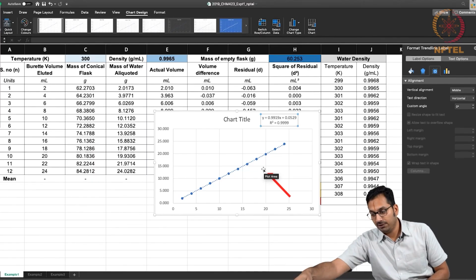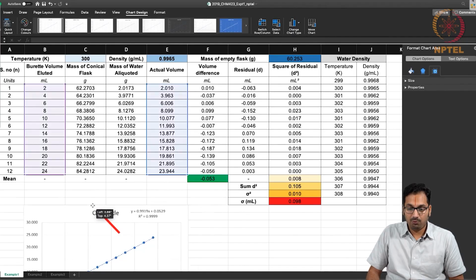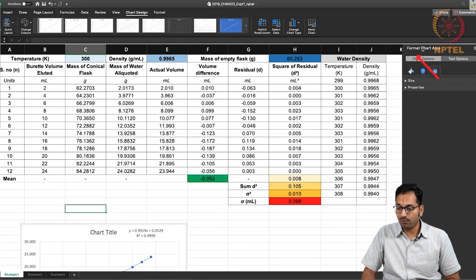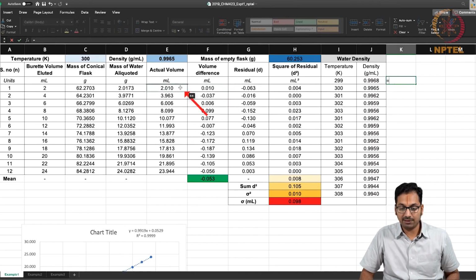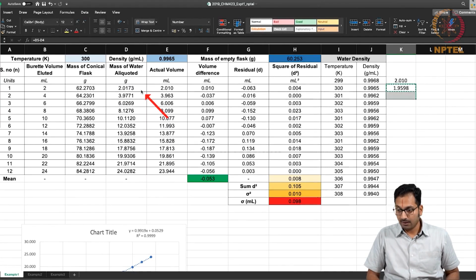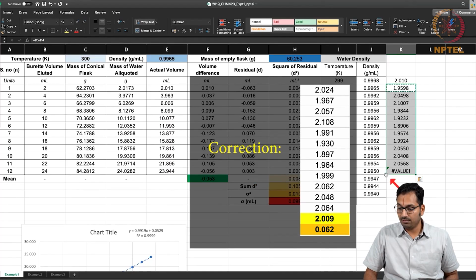Okay, now having understood that, why don't we try to see what is the average value that had come up for each of these measurements. In order to get that, what we will end up doing right now is to take the difference between the values that you have obtained. So for the first one you already got 2 ml. For the next aliquot of measurements, we can try to ask what is the difference between my subsequent measurements, and then you copy paste this carefully to understand what you end up getting.